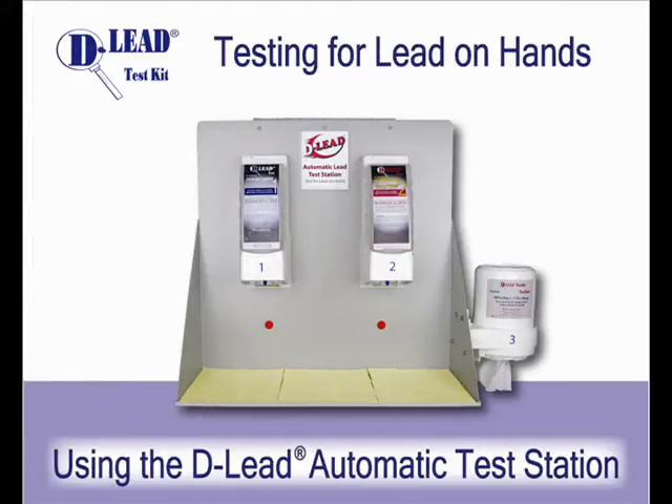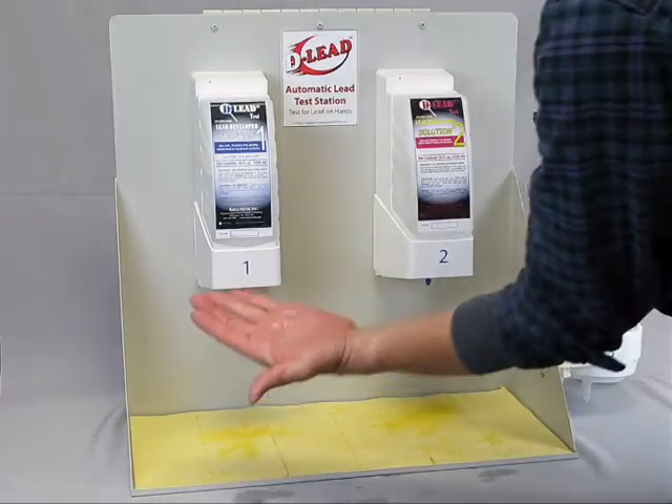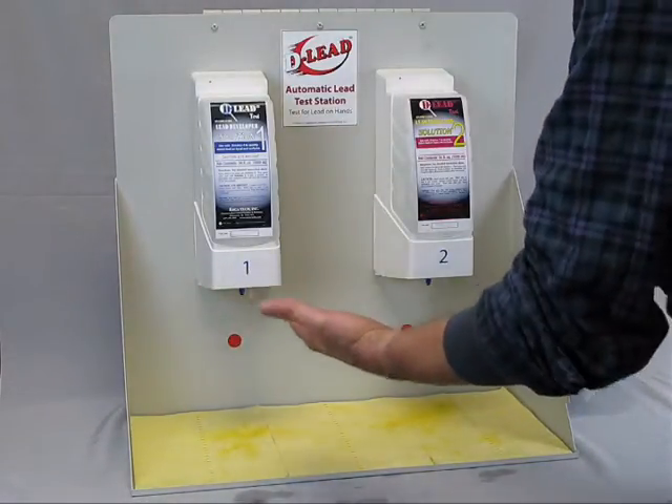Testing for lead on hands using the D-Lead Automatic Test Station. To begin testing, move your hand toward the red dot under Dispenser 1, which will dispense solution onto your hand.